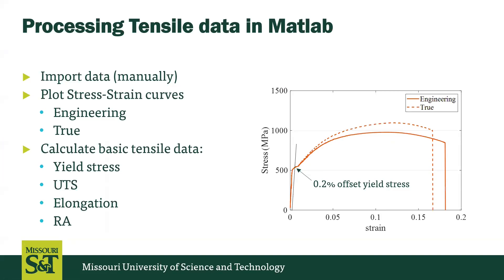Hi! In this tutorial, we are going to go through a couple of lines of code to process raw data from a tensile frame and plot this data in MATLAB to extract the stress-strain curve. You can extract the engineering or also calculate the true stress-strain curve. Additionally, we can obtain basic data from the tensile experiment, such as yield stress, ultimate tensile strength, elongation, and reduction of area.